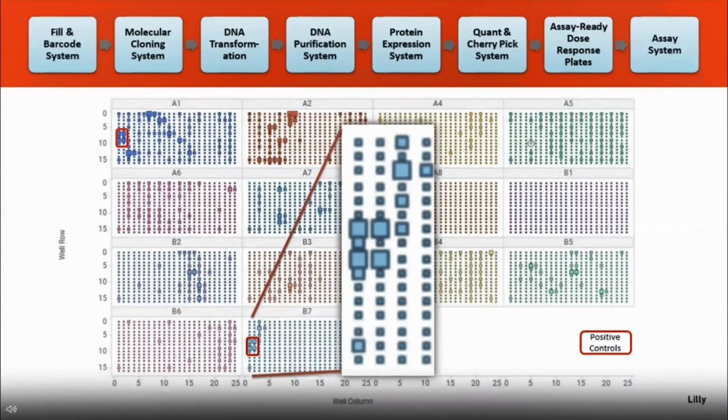And so this is really not the final analysis, but this is what I would throw data into a Spotfire report like this very quickly, or even as screens are running, just to be able to see any trends and make sure that the quality of the data is looking good. And then from this particular experiment, there are some sledgehammer, like really, really strong hits in plate A2 that ended up becoming important for us later on.